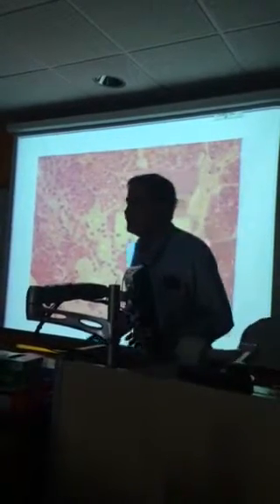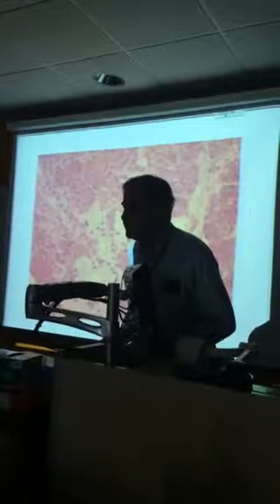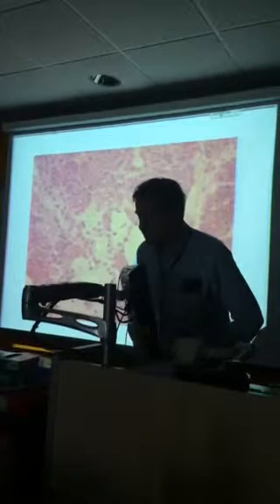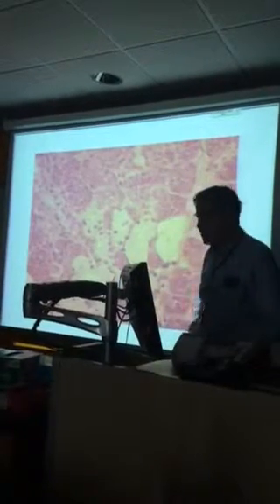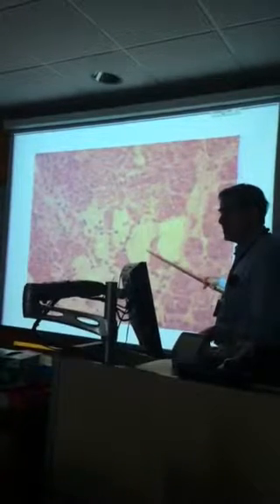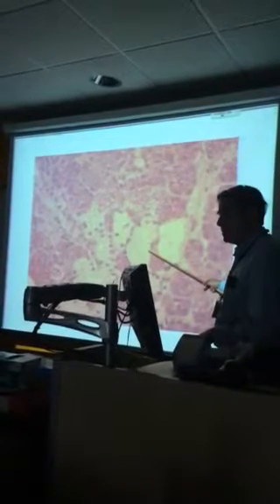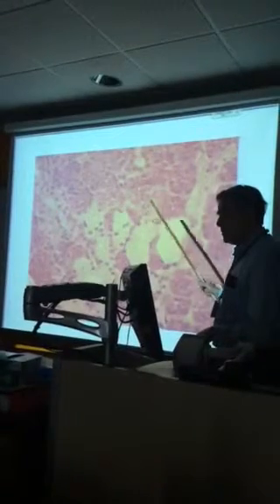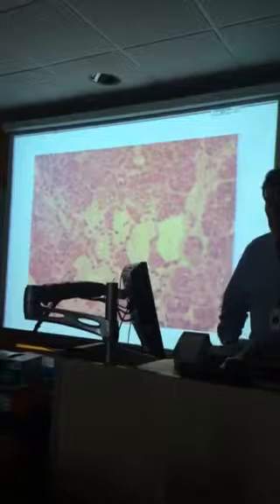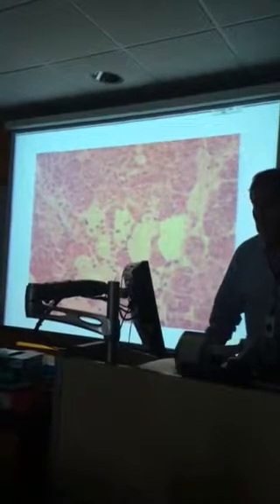Any questions on this? Can you go over that one cell again that you said wasn't fat? You're saying it has simple squamous around it. There was one you were showing that was something else, not fat tissue. Yeah, it was the columnar. And all the cavities? The ducts. Oh, the ducts.